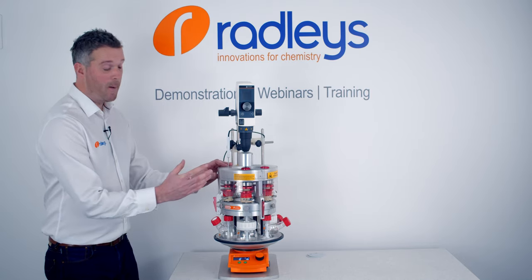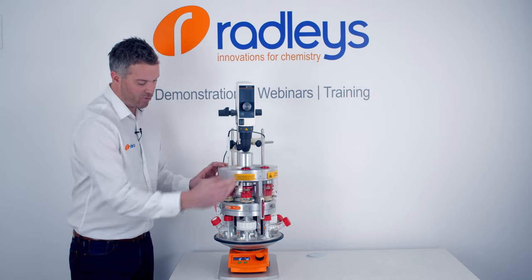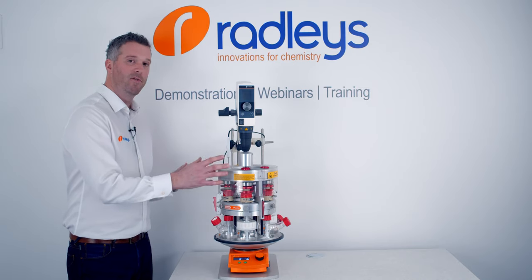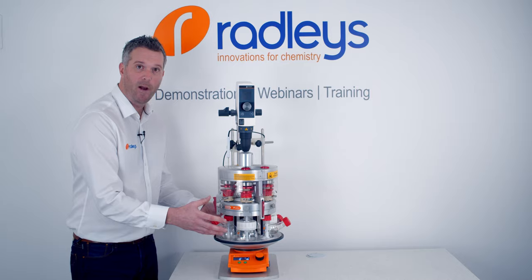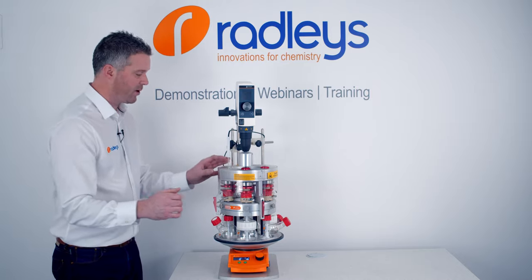The Tornado Head is a belt drive that allows one single overhead stirrer to drive six paddles in the Carousel 6 below. It just drops on top of the standard Carousel 6. So if you've already got the Carousel 6 base and you want to upgrade to mechanical stirring, you can just drop the Tornado straight on top.